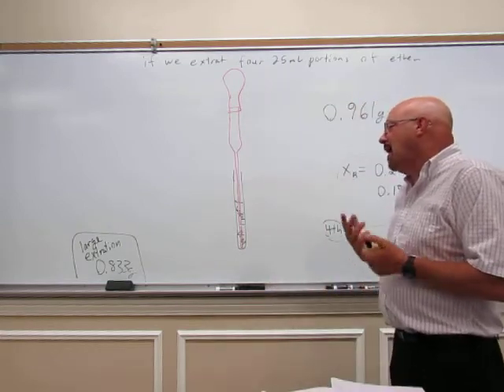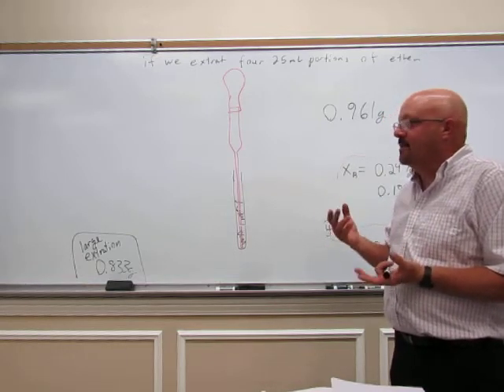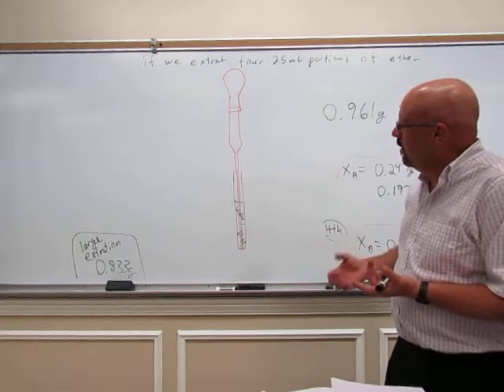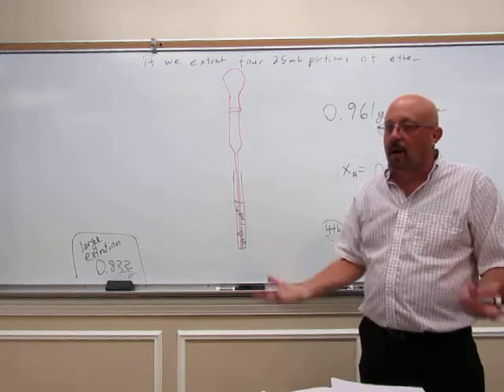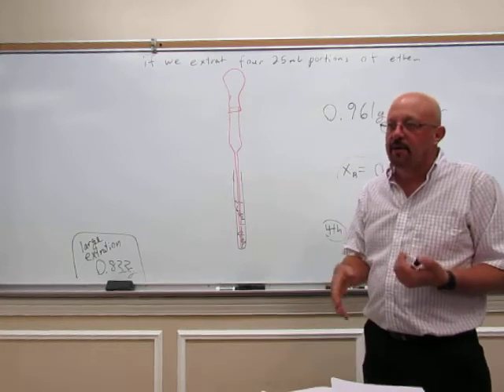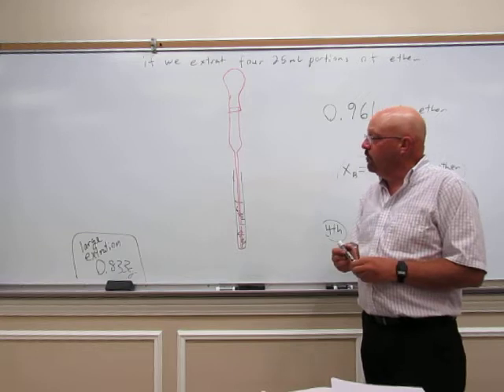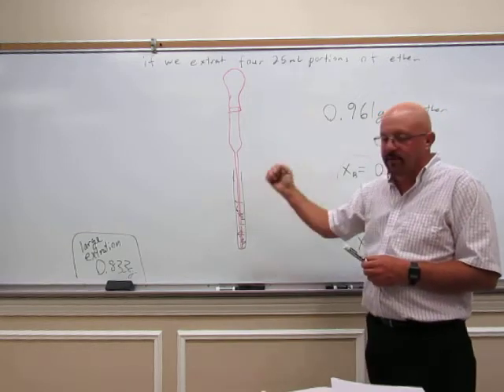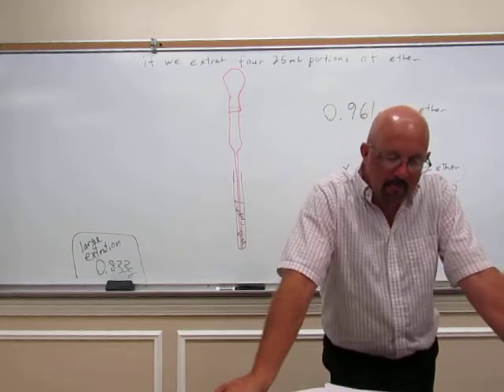Now, if you happen to suck up some of the water, again, it takes some getting used to. If you happen to suck up some of the water, just squirt everything back in the reaction tube, let the layers separate again, and try it again. You may have to try it several times here in the beginning. You'll get used to it after a while. You'll get good at it once you get used to using these Pasteur pipettes. But if you accidentally suck up some of the water, just like I said, squirt everything back in and allow the layers to separate and try it again.